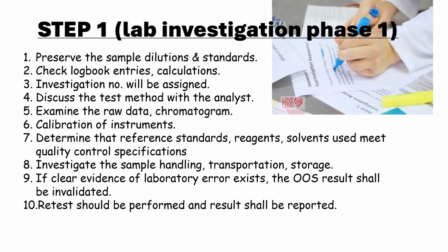Now, the HOD will discuss the test method with the analyst to check that the analyst has performed it correctly, to check the correct analytical method was used during the analysis. Was the analytical method adequate and followed properly?